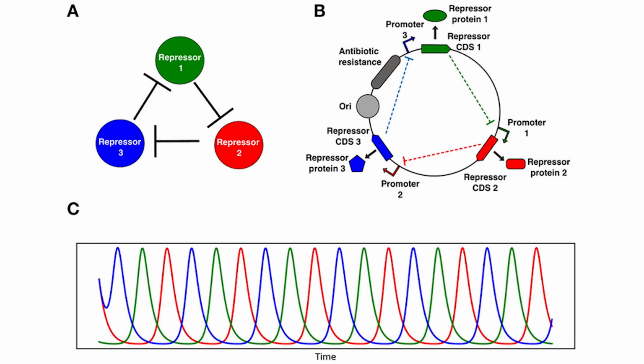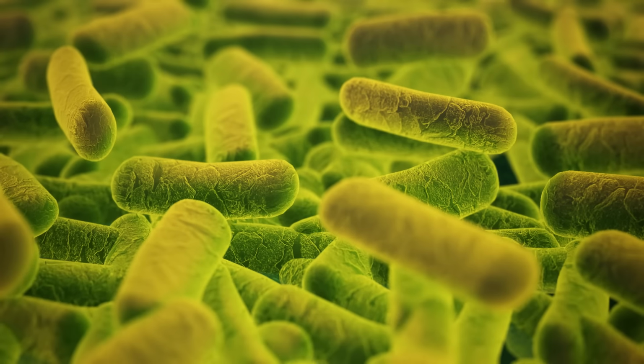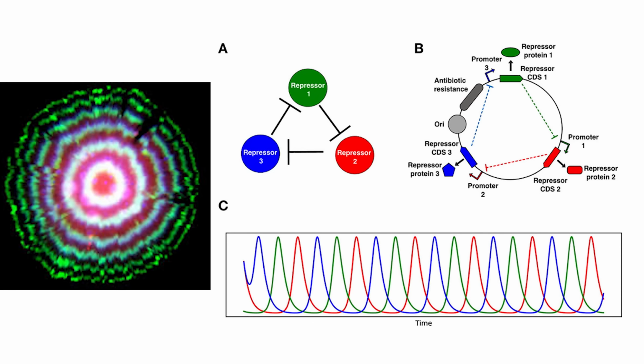Like all coding languages, learning them is best done by starting with simple examples, and we'll build up to more complex use cases. We'll start with literally the most basic use case, making a bacteria produce one new protein, and we'll work up to building metabolic pathways, logic gates, and oscillators by the end of the video.